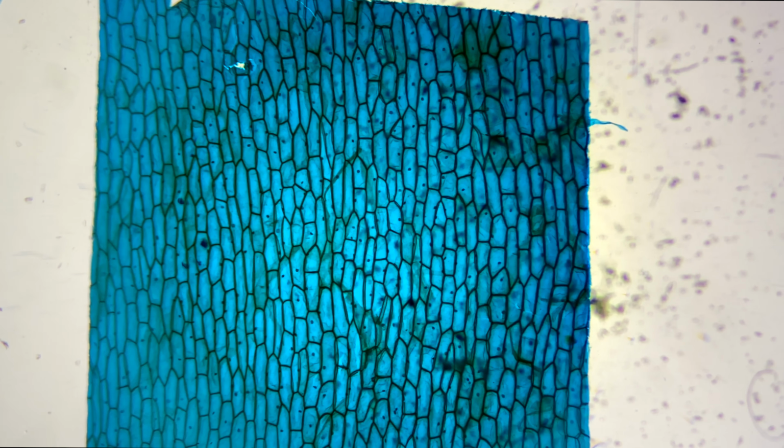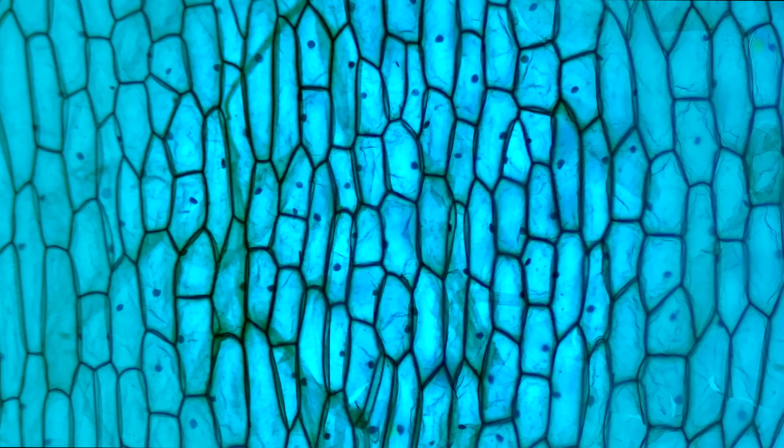Now to one of the most popular specimens to observe under the microscope of all time is the onion epidermis. And it's in the name, epidermis, so clearly this is the epidermis of the onion. But you can also see the nucleus.